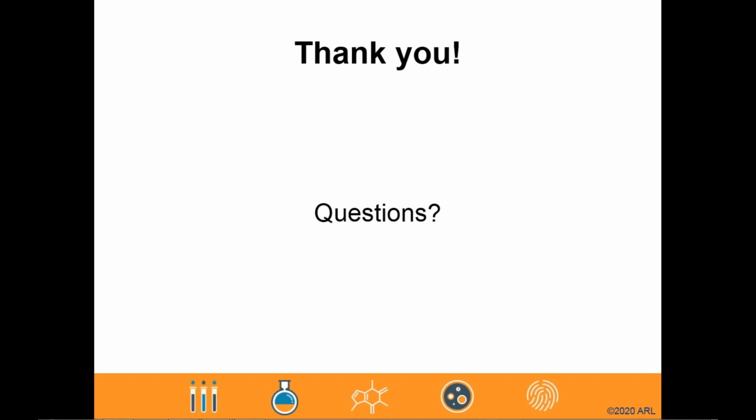Okay, one of the questions is an ARL-specific question. Will a method suitability library be available to customers? So we currently have a process where we will compare incoming new formulations to formulations for which we have already established method suitability. We are currently only utilizing that methodology for USP 71 or traditional growth-based sterility tests. At some point down the line, we may develop a library system for the rapid, but it's not something we're offering at this time.